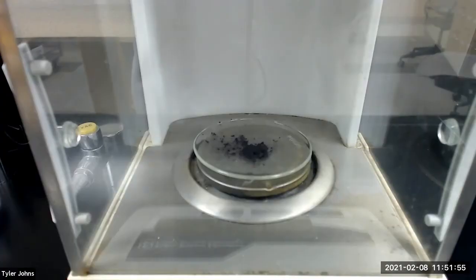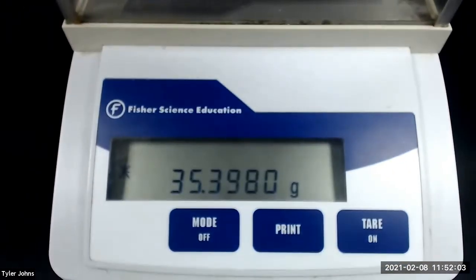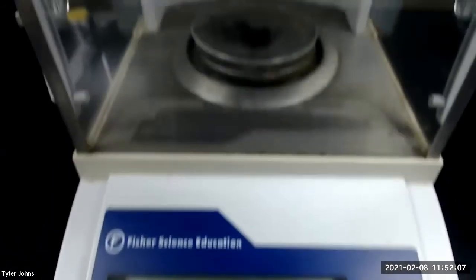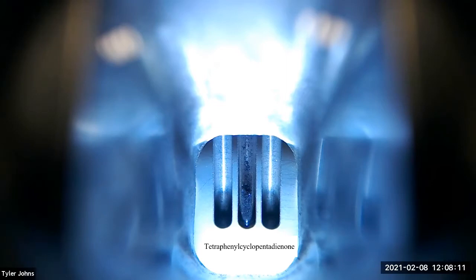After drying, the mass of the pre-weighed watch glass and the tetraphenylcyclopentadienone product is 35.3980 grams. We will now perform a melting point determination of tetraphenylcyclopentadienone.